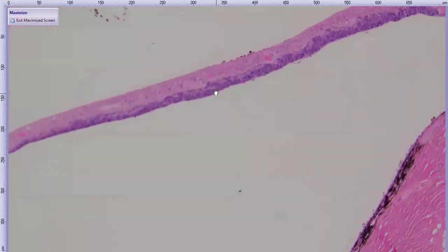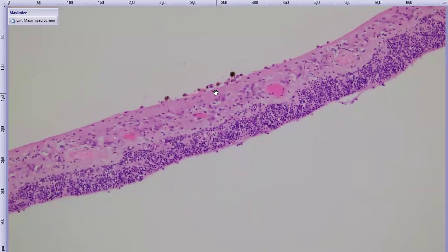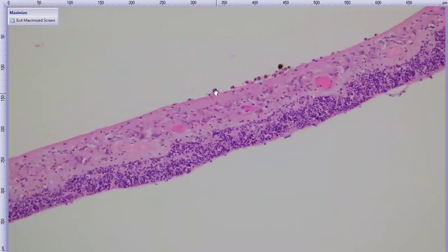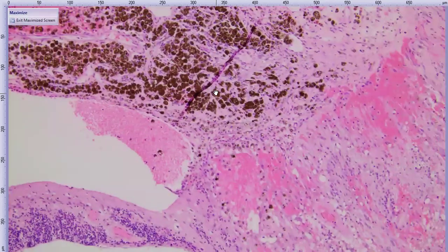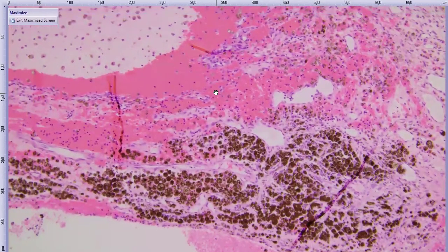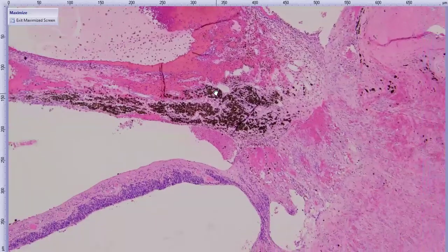And again, more cellular and pigmented debris in the vitreous. And our retina is detached and a little bit atrophied. We don't have any more ganglion cells left, and our layers are kind of jumbled up here. So we have retinal atrophy, detachment. There's also a little bit of hemorrhage and like a fibrovascular membrane with a lot of pigmented cells extending off into the vitreous. Kind of secondary changes here.